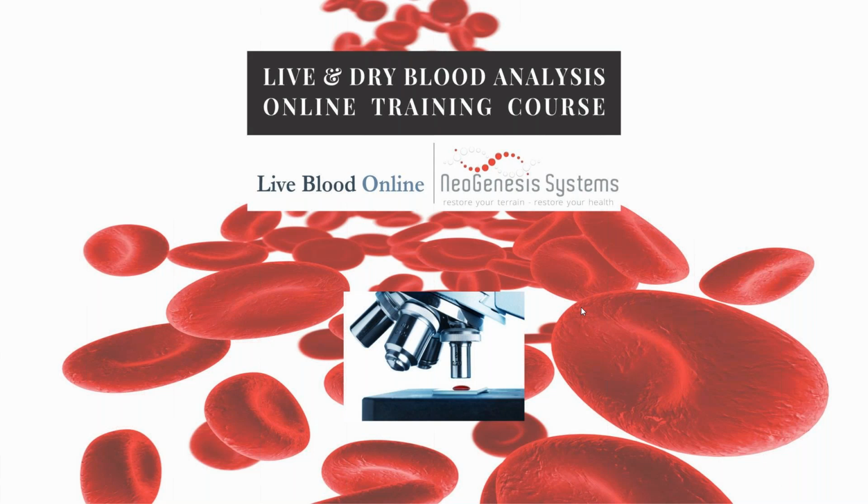Thank you. And can I take the training course without a microscope? Well, yes, you can certainly enroll in the training course and cover all the theory aspects of live blood analysis without a microscope. For certification, though, you would require access to a microscope. We require a test case to be submitted.